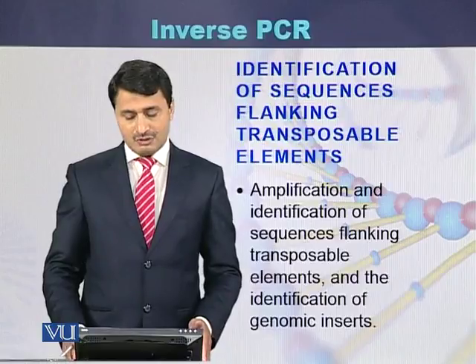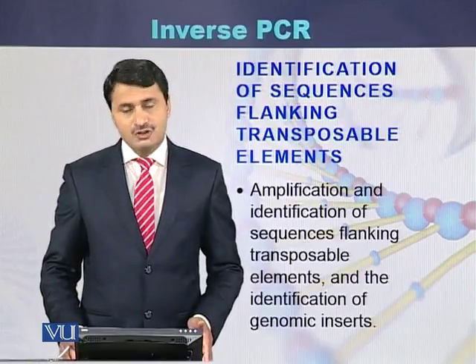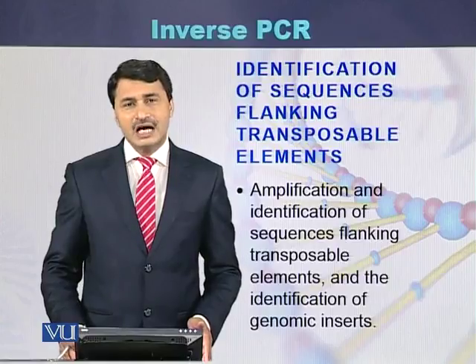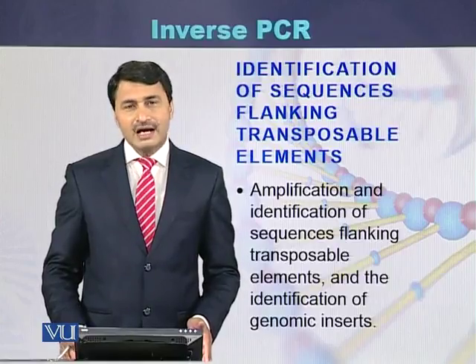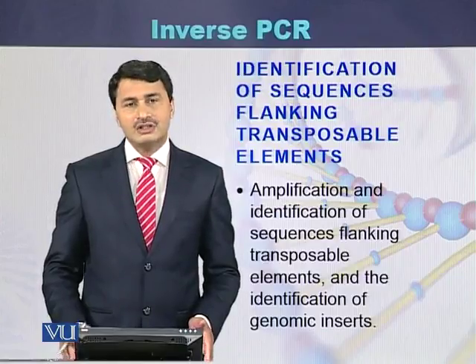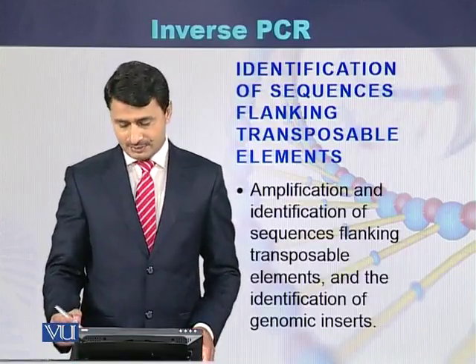Identification of sequences flanking transposable elements. In most cases, inverse PCR is used to identify those sequences which are flanking the transposable elements.